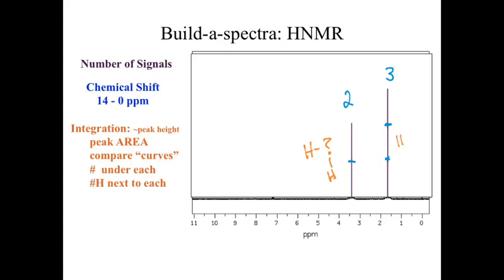Well, again, we knew it was a hydrogen, and because of our chemical shift, we know it was a carbon. How can I get 3 hydrogens all chemically the same as each other? The easiest way is to put 3 hydrogens on a single carbon. Okay, so we started with ultimately a bunch of lines, and now we actually have 2 substantial pieces. Okay, and that's really what we're trying to get out of this.